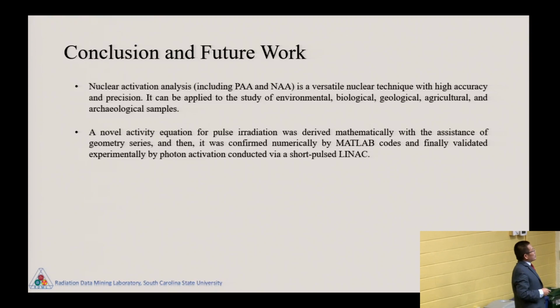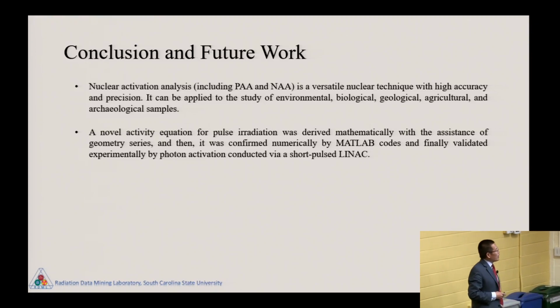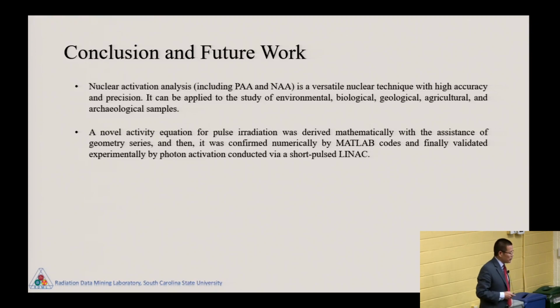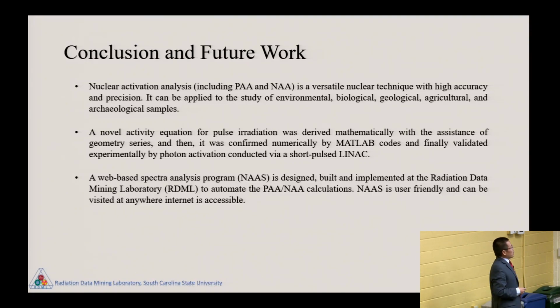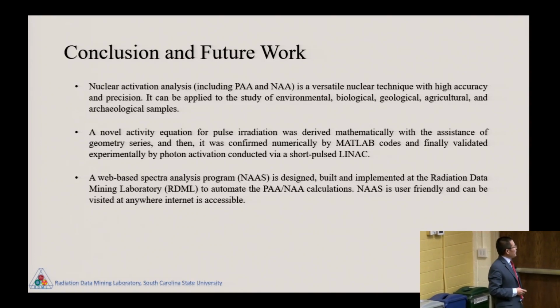And we derived a activity equation for pulse irradiation and confirmed it with MATLAB, and also proved it experimentally, and it will be in the textbook in the future. And we have a web-based spectrum analysis program that is user-friendly and can be visited anywhere when internet is available. I could still do calculations when I was in China.